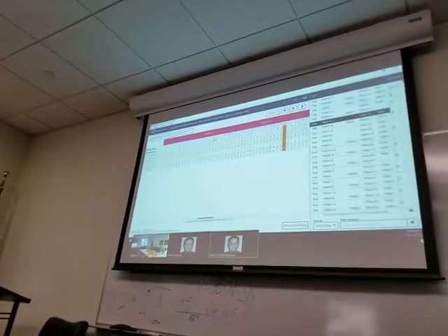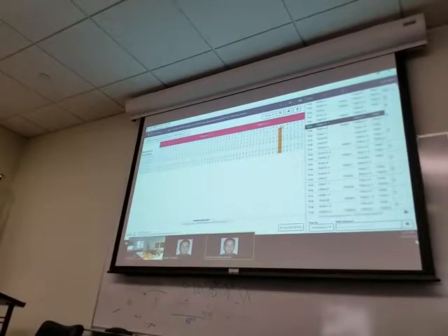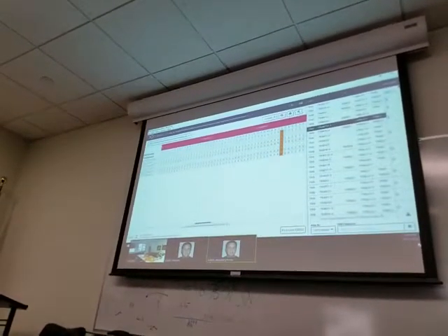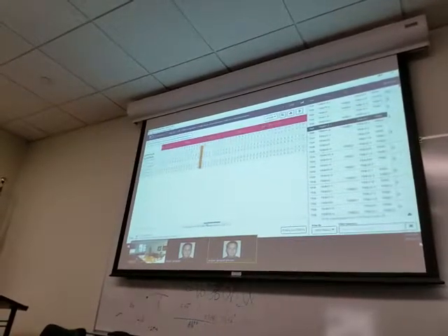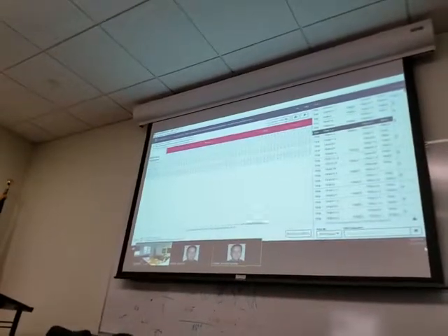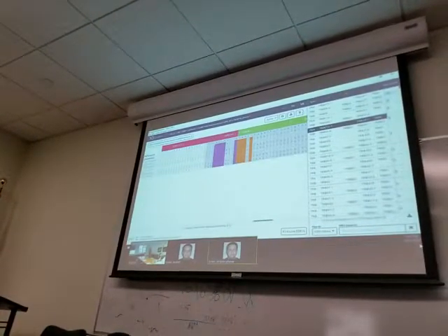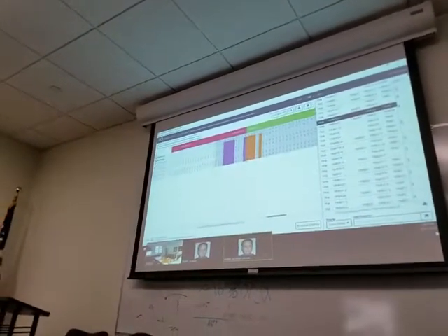And if we zoom in on this, we can see that they all have an A instead of a G here, right? So you can look at some of those things going on through the whole CDR3. And you can see what deletions and other kinds of events are happening in these hypervariable regions.